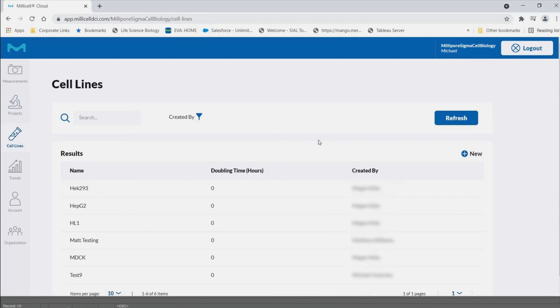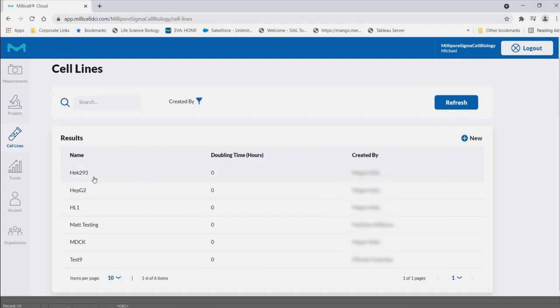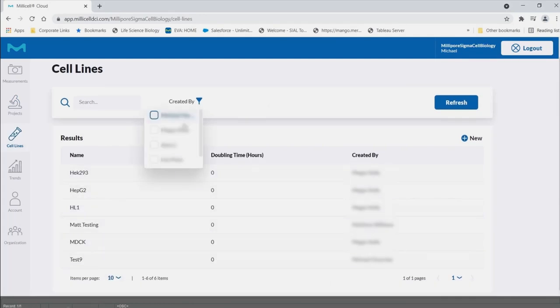Cell lines. Here, all cell lines can be searched according to the cell line name or creator.